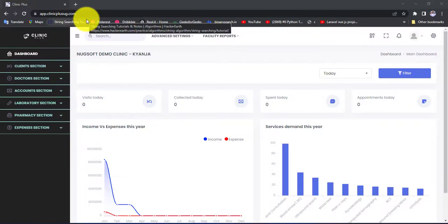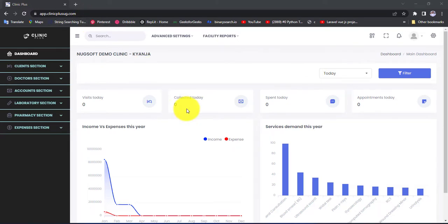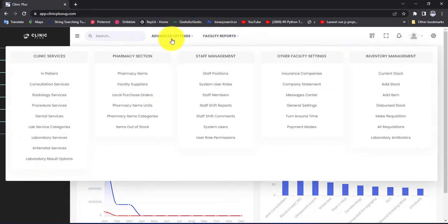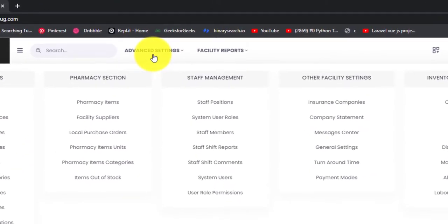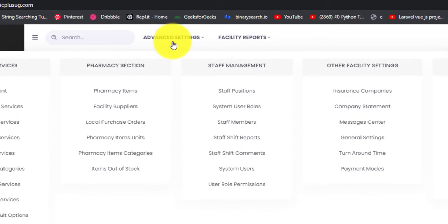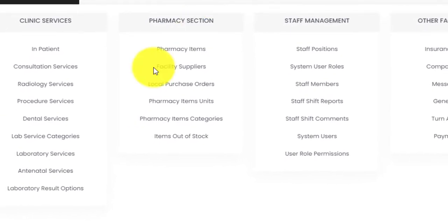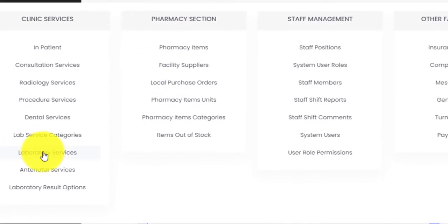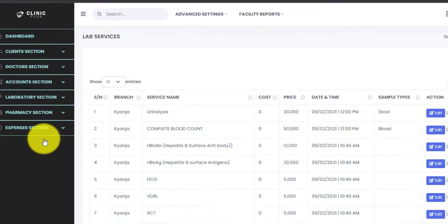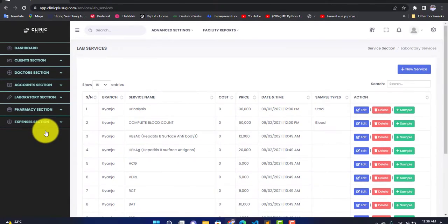Hi everyone, welcome back. Livingstone here, and in this video I'm going to show you how to add lab services into ClinicPlus software. Without wasting time, let us do that. We are going to come on this advanced settings link, click on it, and look for a link called Lab Services, which is right here. Click on that link.